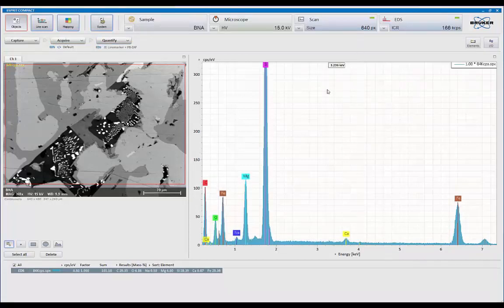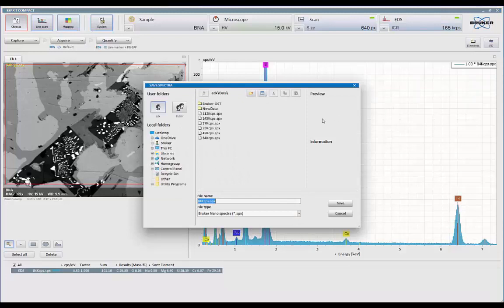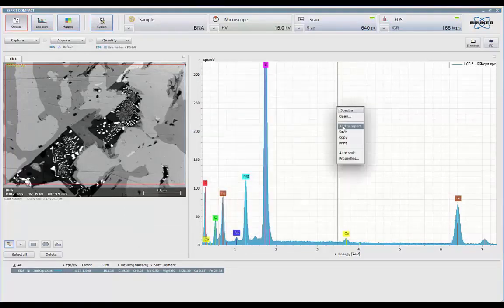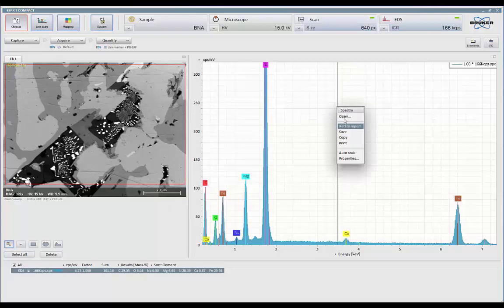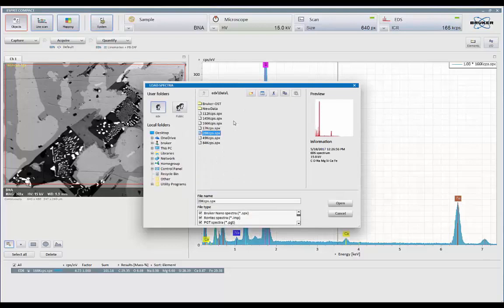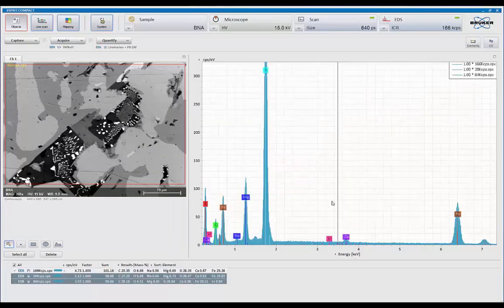So with that, let's save that result. So that's 166k CPS. And let's call back our other spectrum. So again, I'm just going to press the right mouse button. And we're going to hit open. So we have the one at 20,000, and we have the one at 84,000 that we want to add right now.